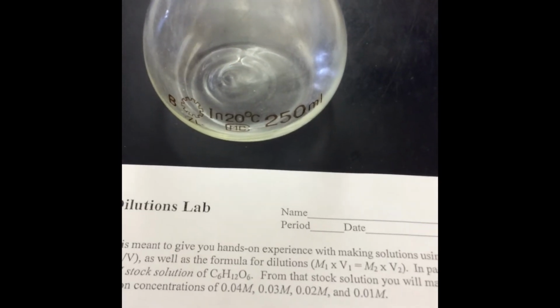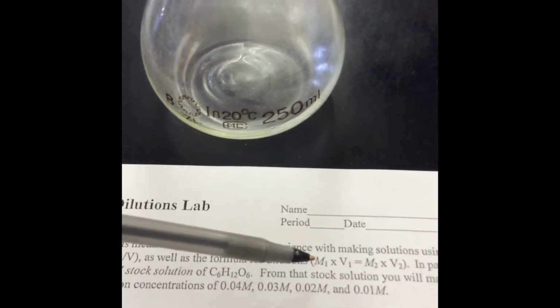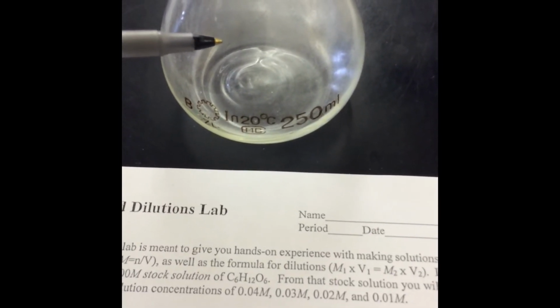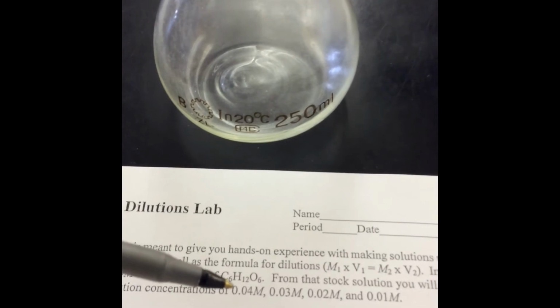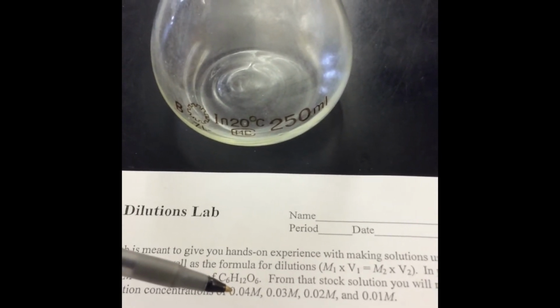So what you're going to do, once you have your stock solution, you're going to do a little bit of math using this equation, M1V1 equals M2V2, to figure out how many milliliters you have to take out of this stock solution to then dilute to these lower concentrations.